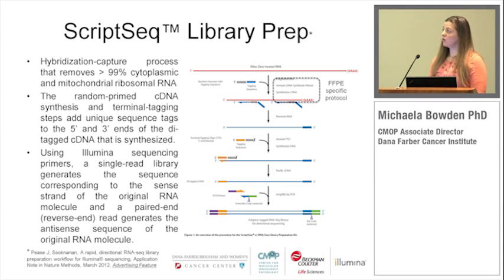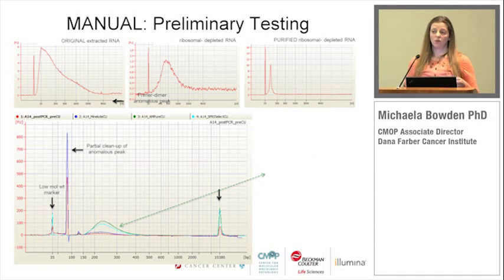And so anytime we go to automate a process, because our samples are so precious, we don't have expired reagents or archival tissue that's lying around to test on. So it's very specific how we go about this. We usually pick a representative sample based off what we see for the RNA yields and RNA bioanalyzer trace. We pick something right in the middle, so where it's not the worst and it's not the best case. And then on the bench, we do a prep with this, provided we have enough material to not only do a bench prep, but an automated prep too.